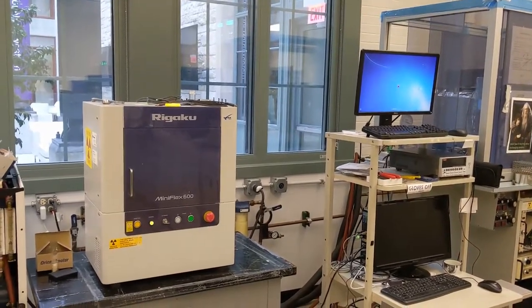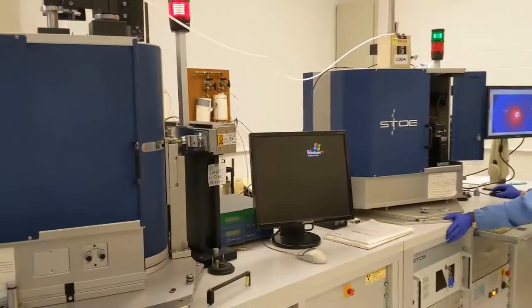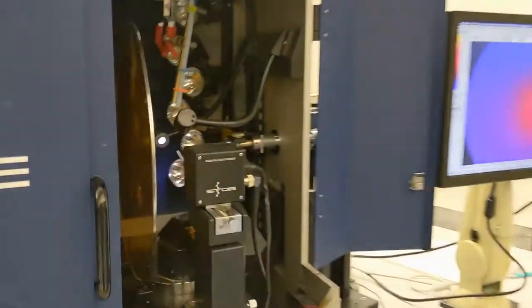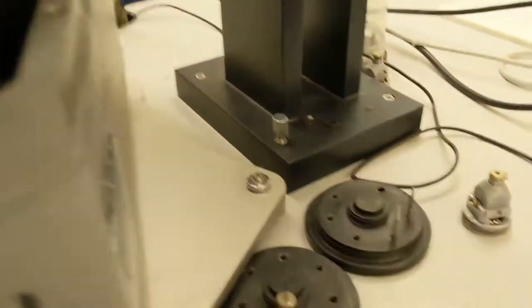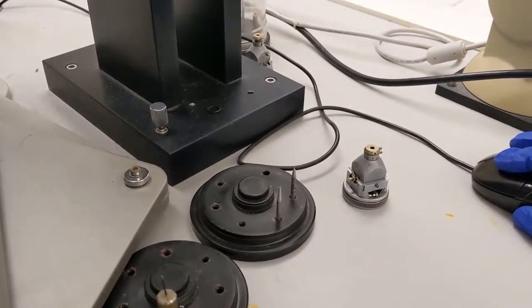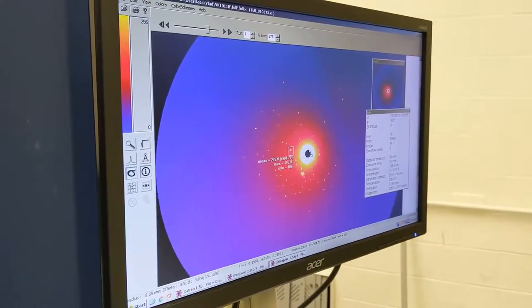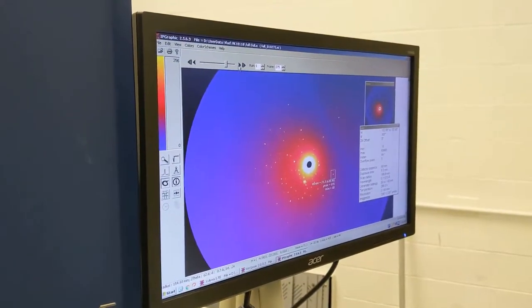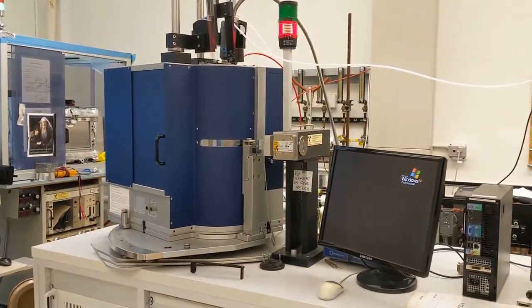In this upstairs room, in the same room as the upstairs mini-flex diffractometer, we also have two single crystal diffractometers in-house. If we take a look at the insides, you can see how you load your sample — you take your goniometer head, put your crystal on a glass tip, and when you run the instrument, you can use the software to check out certain frames, check out diffraction patterns, etc. Although we do have instruments in MSERC downstairs, having two in-house means you don't necessarily need to wait in line to run single crystal diffraction.